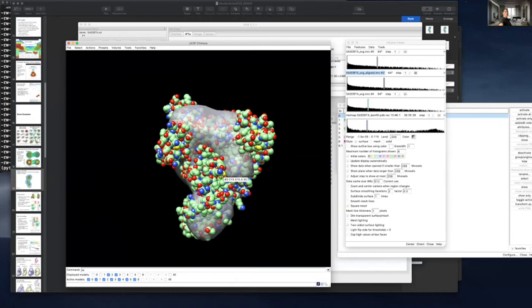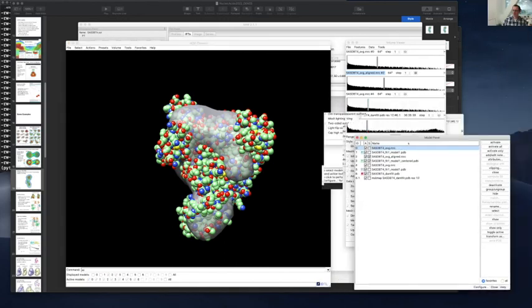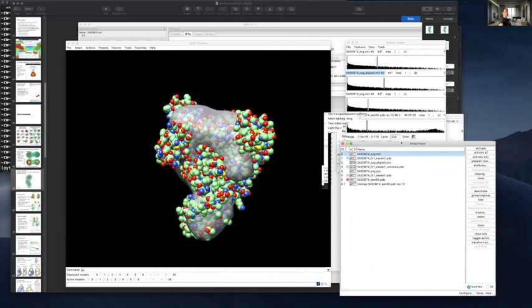So, Thomas, I had a question on exactly this point. I don't know whether RAW has an easy tool for extracting volume. And of course, that's assuming that the particle has uniform density. But I was wondering if you would recommend using the volume extracted from the SAXS curve to help you set this contour? Yeah, so that's a good question.